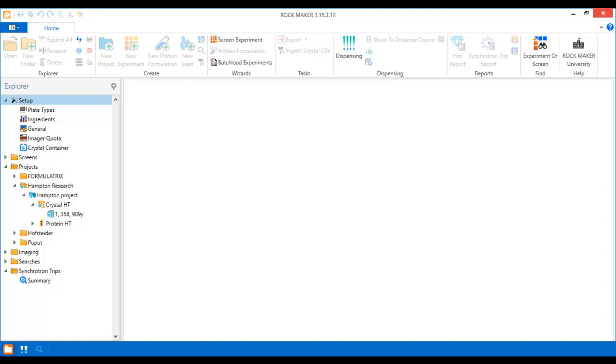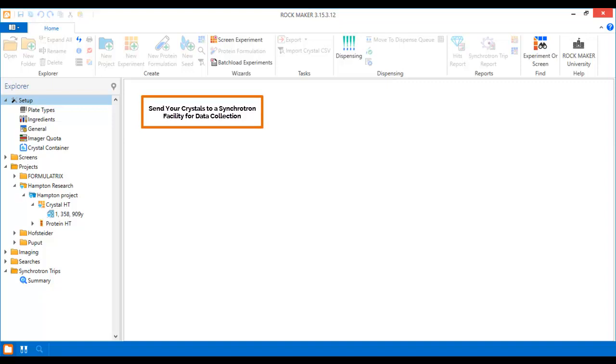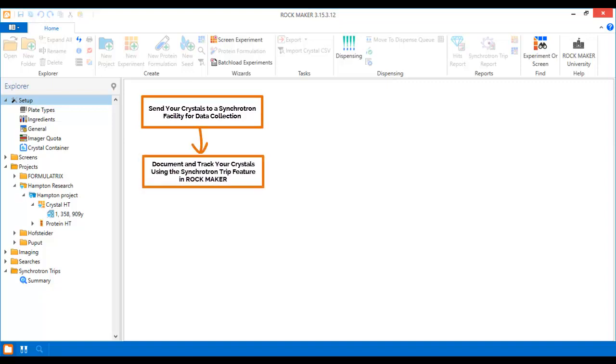RockMaker is not only a powerful tool for designing experiments, but it can also help you plan and manage your synchrotron trips. Synchrotron trip management in RockMaker helps you stay on track by keeping all of your trip data in one place.